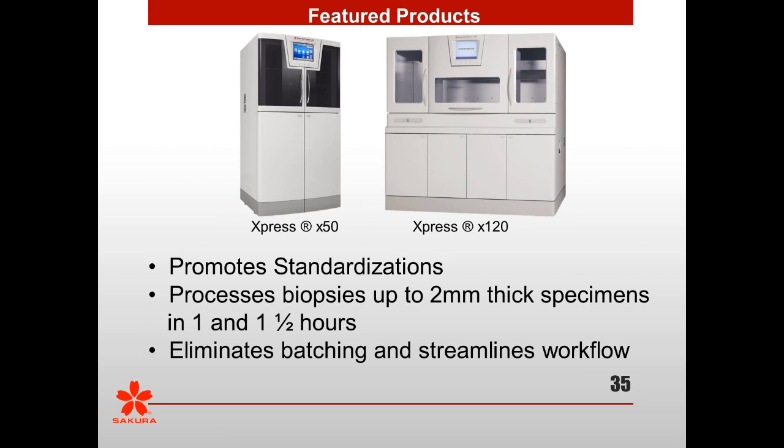There are a variety of instruments out there that allow you to improve quality, reduce variation, and give you good consistency. I think what you choose in your laboratory is a bigger discussion, and it has to involve the pathologist. As you go to instruments, whether a processor or a stainer, you have to look at the options for adjusting times and volumes, especially with H&E stainers. The Symphony uses a proprietary reagent. It has a very narrow variation in the protocol, and it is one method of standardizing that H&E.